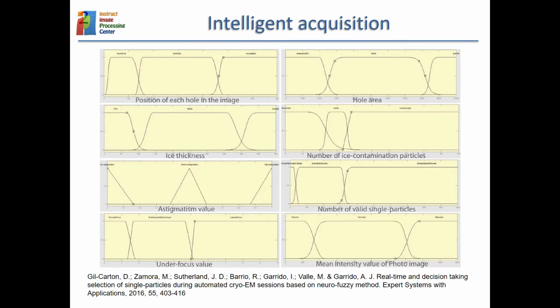So there have been some ideas about making the acquisition more intelligent, with some fuzzy ideas of how to take decisions. The idea is not to comment specifically on this paper, but just to let you know that there are algorithms that can help you to take decisions early during the acquisition.